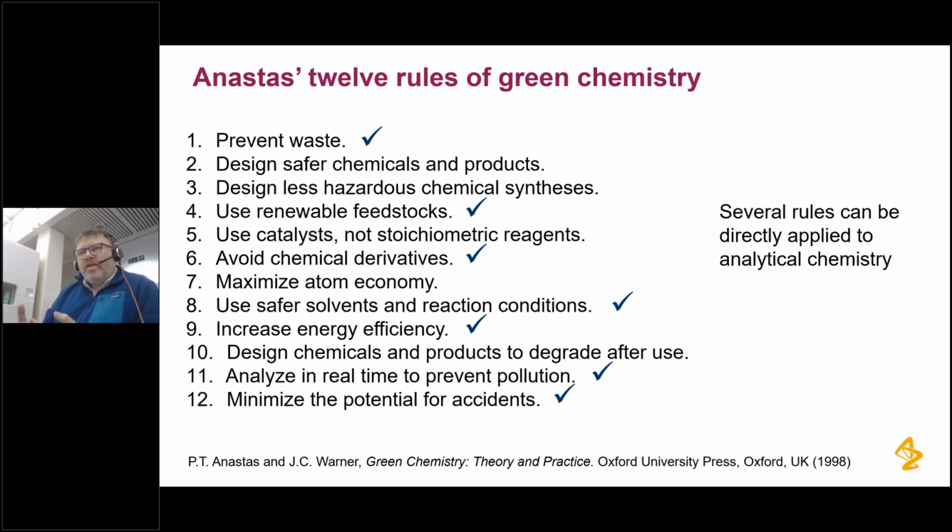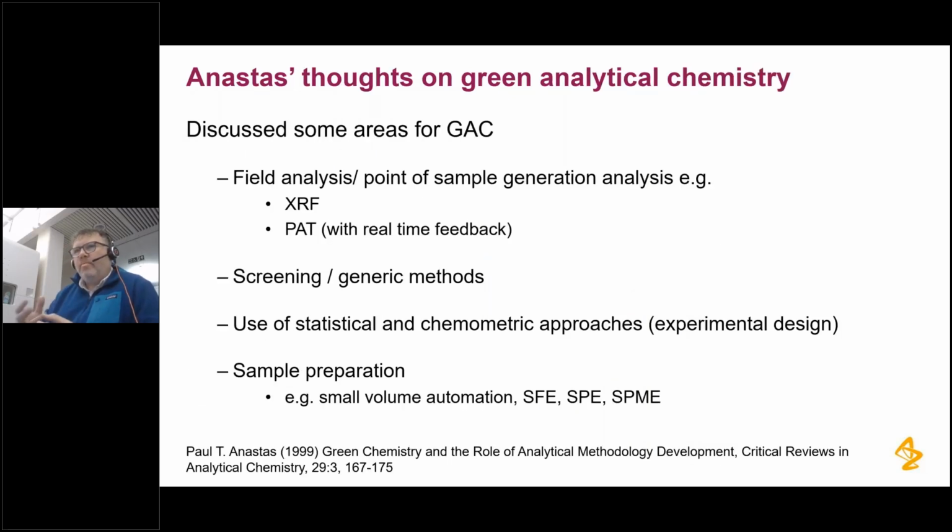And also, is it possible to almost do your analysis at the point at which the sample is being generated? And also in real time, not having to transport samples to different places. So all of these really started to crystallize thinking around how we, as analytical scientists, can think about doing our analysis in a greener way.